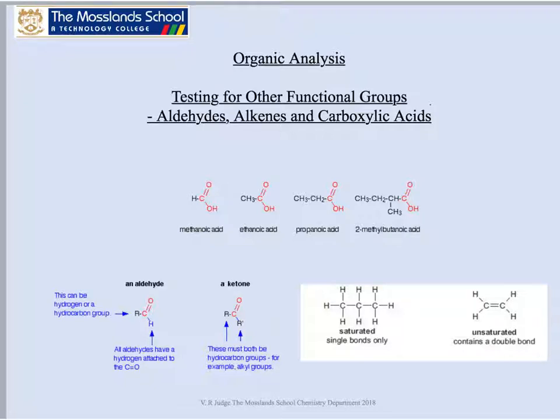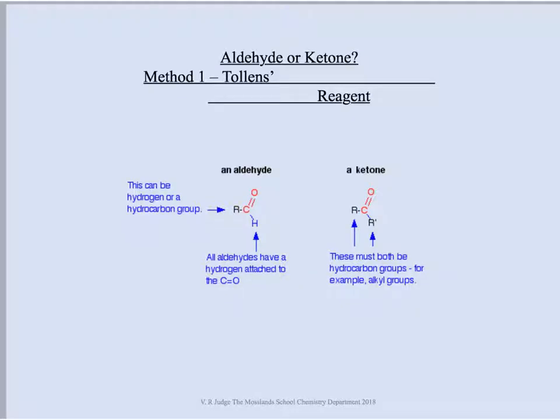This is the tutorial that will go directly before your required practical and will outline the methods used to test for all of these different functional groups, which you're going to carry out yourself in the lesson. So the first functional groups that we're going to look at are aldehydes and ketones.